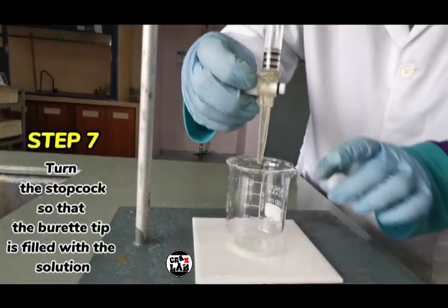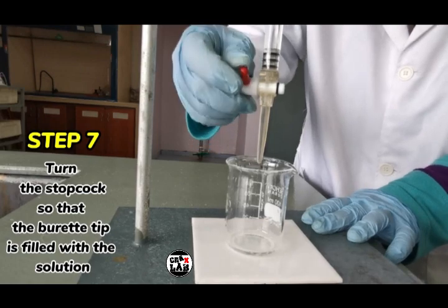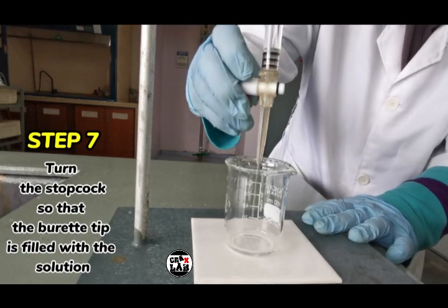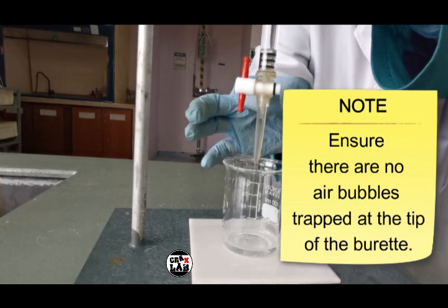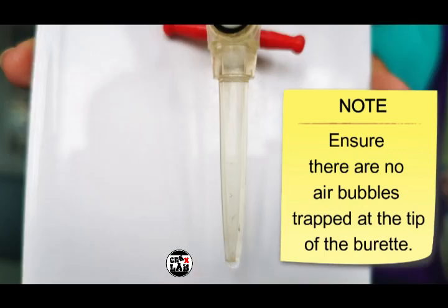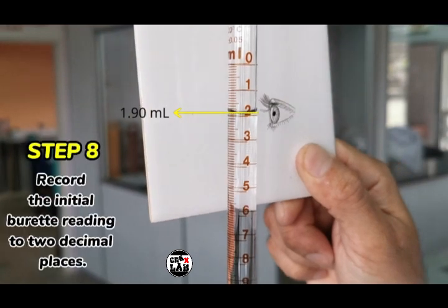Step 7. Turn the stopcock so that the burette tip is filled with the solution. Ensure there are no air bubbles trapped at the tip of the burette. Step 8. Record the initial burette reading to 2 decimal places.